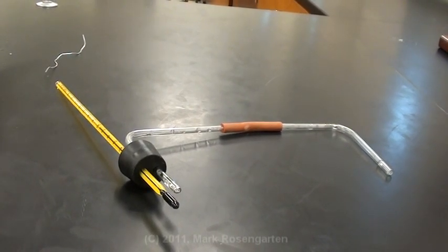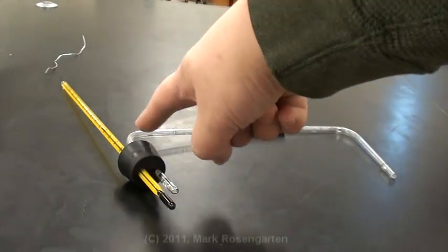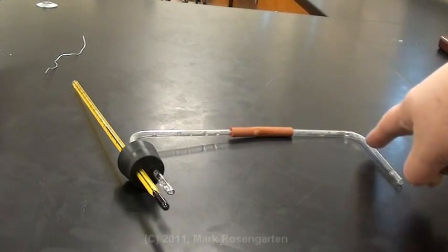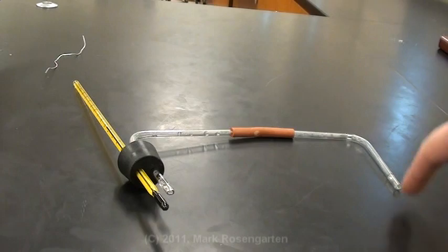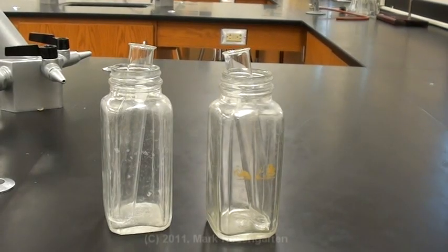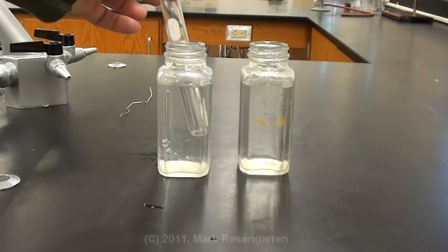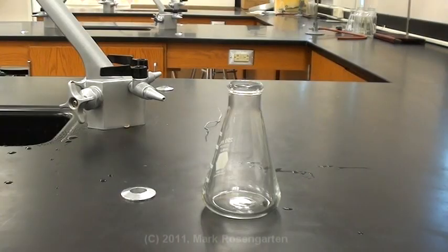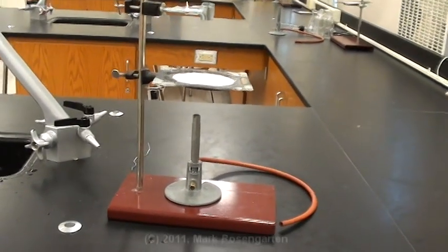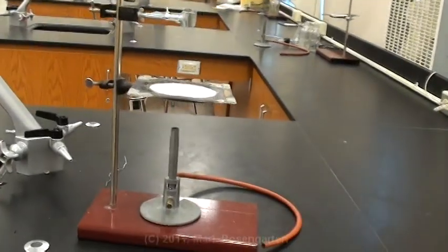For this lab, you need the following equipment. This is your distillation column. You've got a thermometer to tell the temperature. The vapor goes out this tube, hits the cooler air, condenses, and then comes out this end. What comes out this end is called the distillate. You'll also need 2 bottles, mostly filled with tap water, one test tube with bromethymol blue, the other test tube is left empty. You will use an Erlenmeyer flask to hold the soda while you heat it, and you will also need a ring stand with a ring and wire gauze, utility clamp, and Bunsen burner.